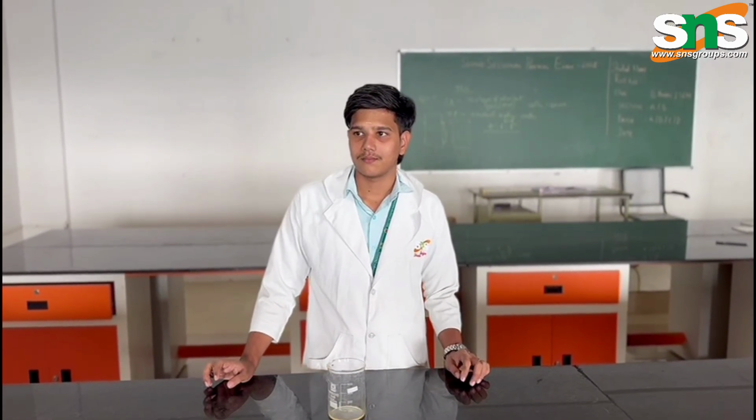The third question, which instrument makes samples glow or shine under special light? We use it to find tiny amounts of vitamins, medicines or DNA. It's the fluorimeter. Shine strong light, excitation light, on the sample. Some molecules absorb the light and get excited, jump to higher energy. They quickly fall back and give out their own light, fluorescence, usually a different color, longer wavelength. The fluorimeter measures only this emitted glow at 90 degrees to avoid the original light.